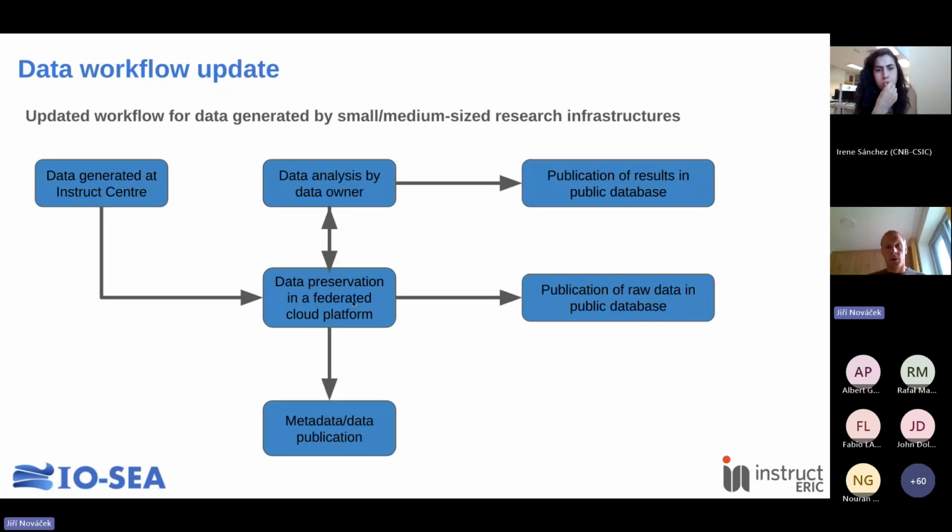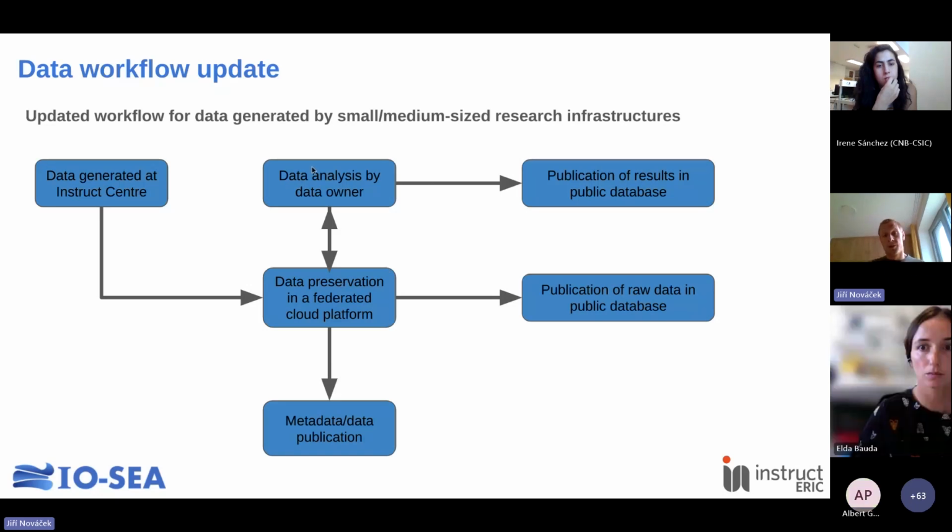So we are working with a cloud platform to which we actually upload the data directly from our instruments. Those data are made available to the user, to the owner, such that they can analyze them and then again publish the results. And we have developed tools that allow us to publish the data or the metadata and the links to the original data upon either user request or upon the expiration of the embargo period.